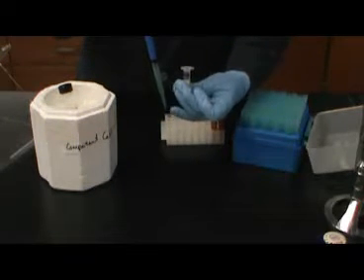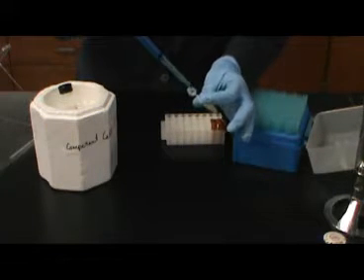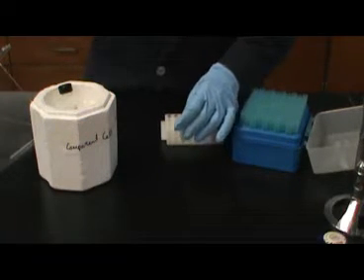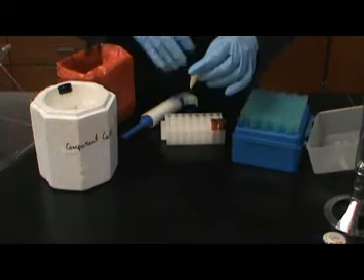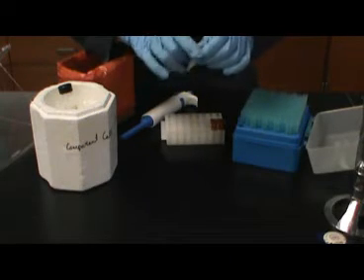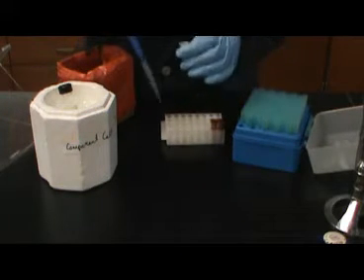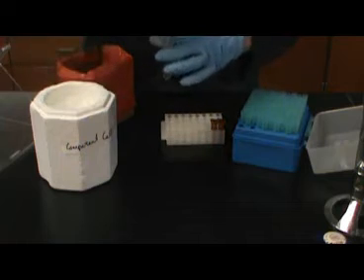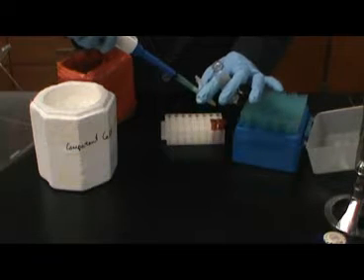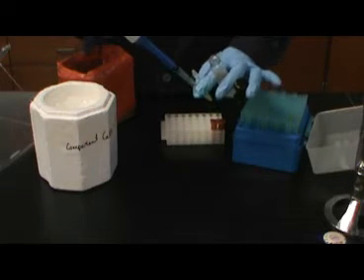This will introduce the calcium chloride to the E. coli slowly. After adding the 500 microliters of calcium chloride, gently tap the tube to mix. Once you have mixed the E. coli with calcium chloride, you will then remove 500 microliters of the E. coli and place it back into the glass calcium chloride vial. You will need to do this twice since there is 1000 microliters of E. coli solution in the microcentrifuge tube. All of the E. coli will be added to the cold calcium chloride.